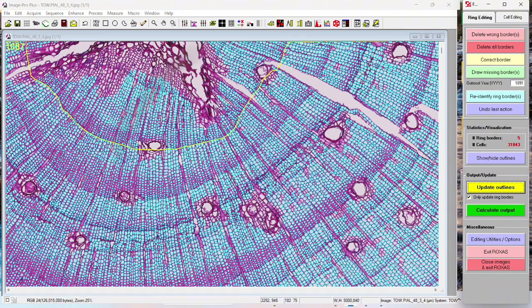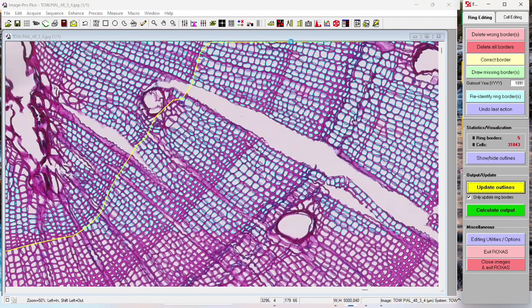So this worked for the most part, so that's great. It did appear kind of curve off. It used to just end right here. It doesn't do that anymore, and all of these that are going off of the top of the image are all going to conjoin up here. We'll see what happens with that, but I'm assuming they know that that's happening in ROXAS when you have images where the ring boundary is going off the top of the image, where all the boundaries are conjoining, and if that happens, then that's fine right now.